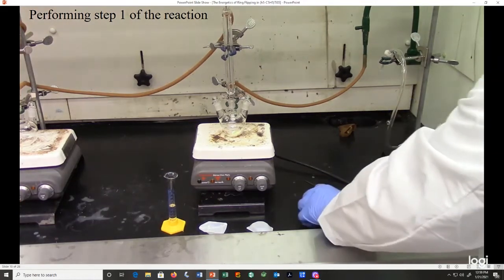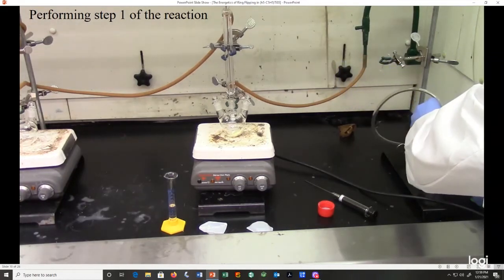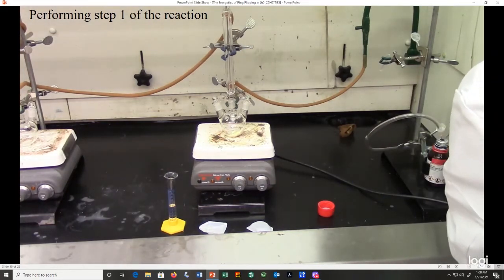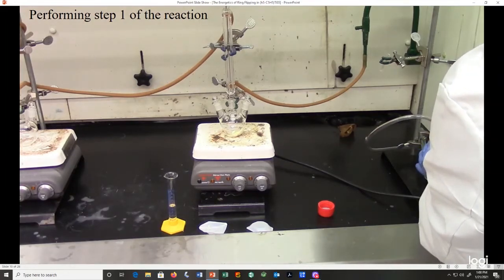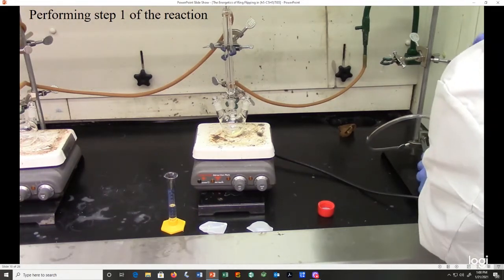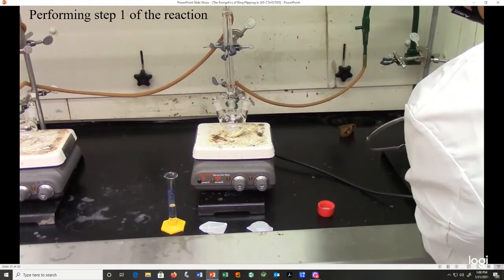The valve to the purge needle was opened up, and what we're going to do is poke that needle just through the top of the septum to put a little bit of positive pressure of nitrogen gas in the headspace of that bottle. And then we're going to take our needle and draw up air or gas into the syringe. So we're basically making sure that there's no oxygen in the headspace of that bottle at this point.